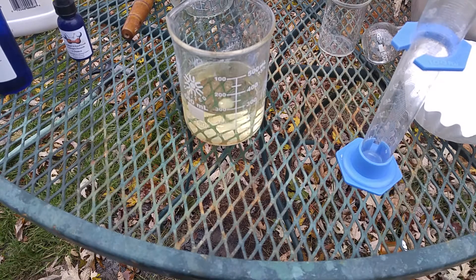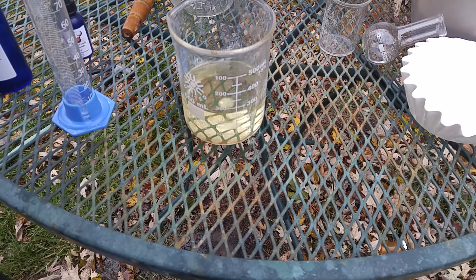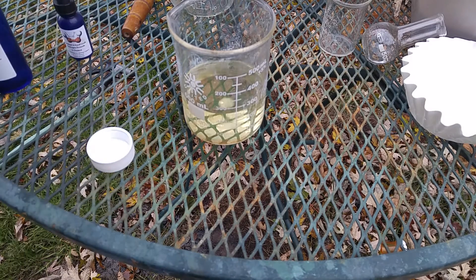Today I will be extracting iodine from potassium iodide. I have prepared a solution of potassium iodide already, just to cut this shorter than usual. Now I will be adding roughly 150 milliliters of hydrochloric acid to the solution.